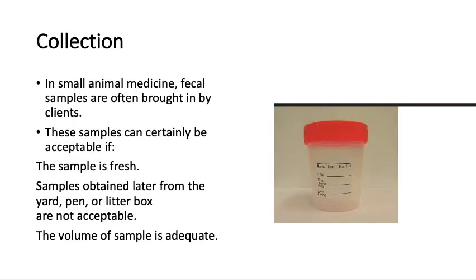Our topic for today is about veterinary parasitology. As in many other aspects of laboratory analysis, sample collection in parasitology is important in achieving accurate results.